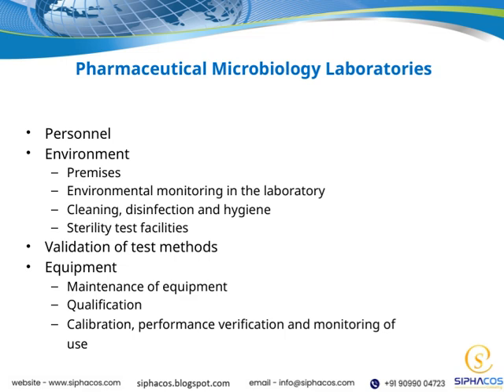Validation of test methods is another critical point. We need to ensure that our methods are accurate, reliable, and reproducible. Validated methods form the backbone of compliant and trustworthy testing.